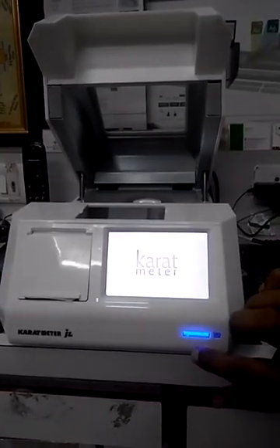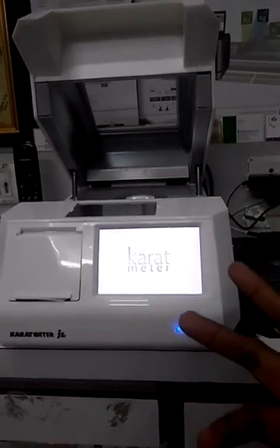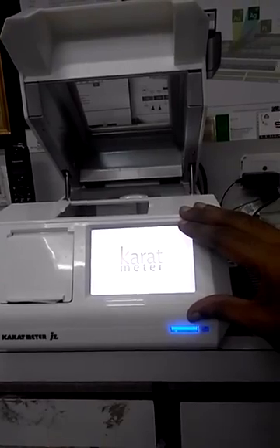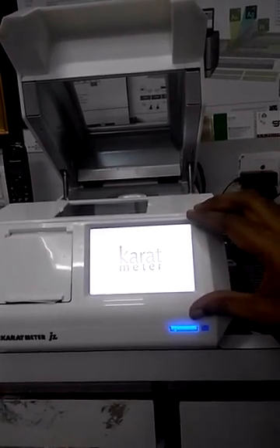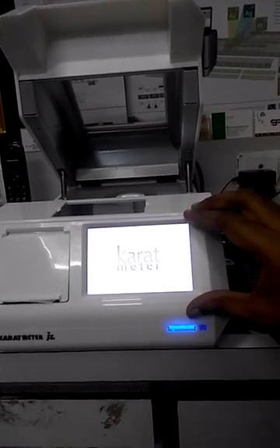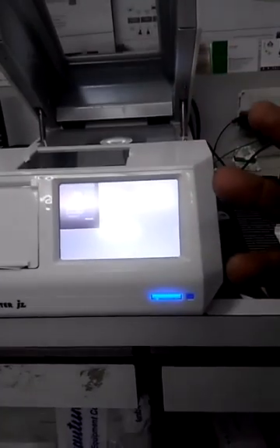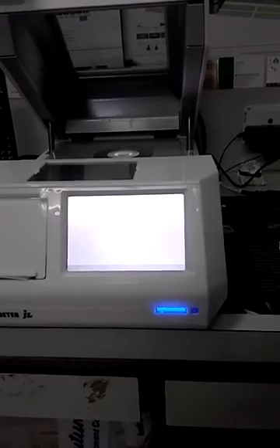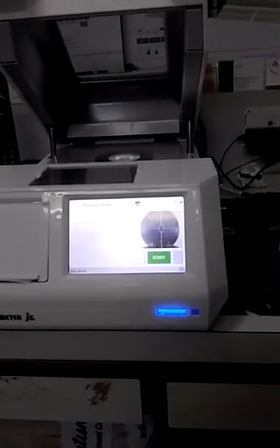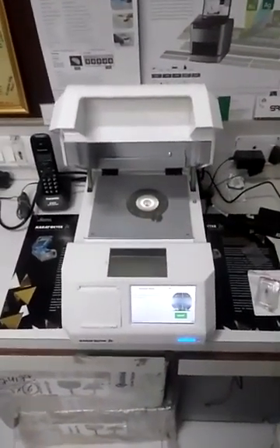The machine will automatically start. This is an embedded computer running Windows. You can see our software will automatically come up and start on our application directly, so you need not worry about where to click.